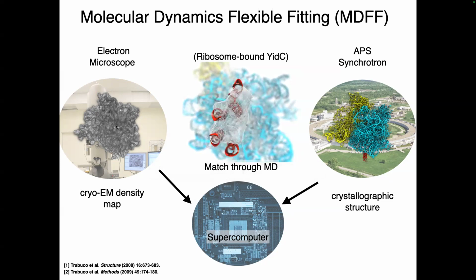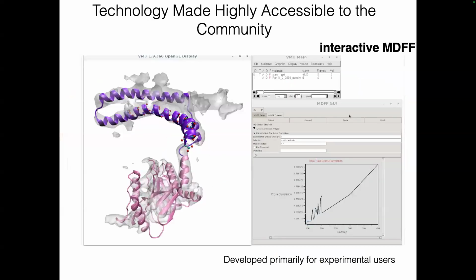We call it molecular dynamics flexible fitting. It's not just fitting, it's flexible fitting, allowing it nicely to go into the density. And many practitioners in the field are using MDFF as a tool for experimental biology these days.